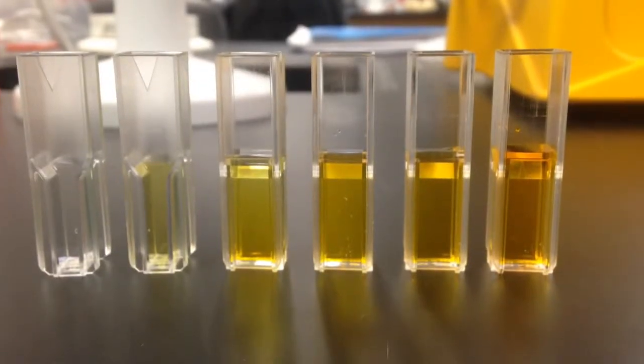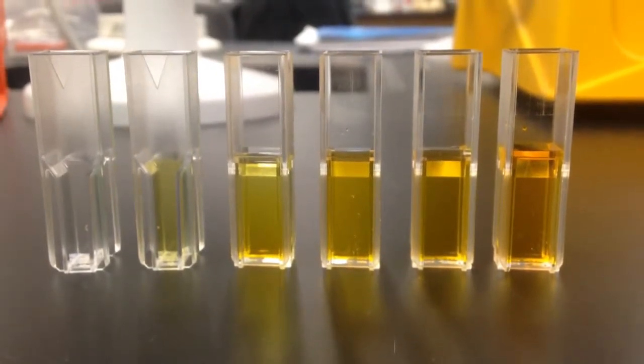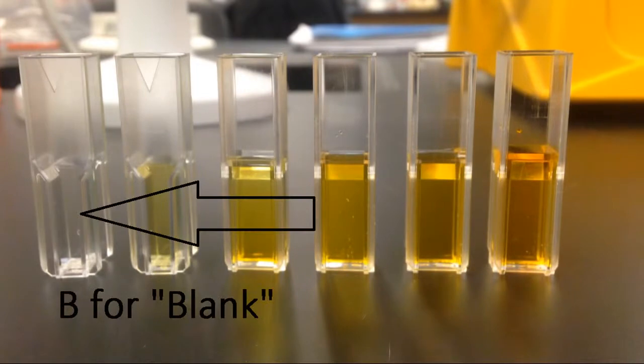For demonstration purposes, I've created a concentration gradient using food coloring. You should always have a blank sample containing the solvent used to dissolve your specimen. In this case, I'm just using water.